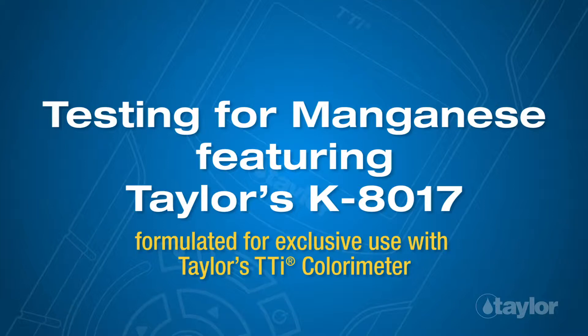Testing for manganese, featuring Taylor's K8017, formulated for exclusive use with Taylor's TTI colorimeter.